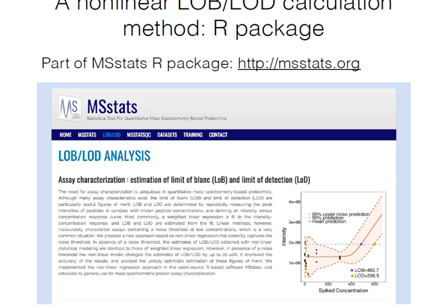So now I'll say a few words about the R package where the new method is implemented. I'm only going to go very briefly over this, because a lot of people don't really know R very well. You can find a lot more information about how to use the package online. So this is the address, and then you have a tab just for the LOB and LOD method, and there are multiple example data sets and an R document that gives you examples of how you can use this new method.